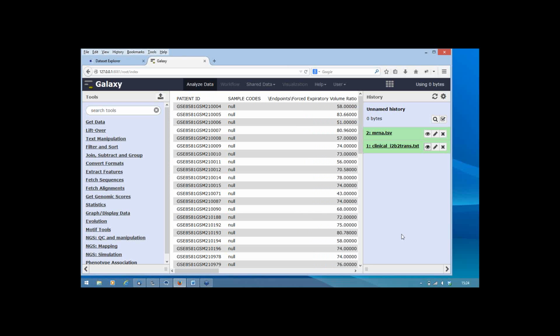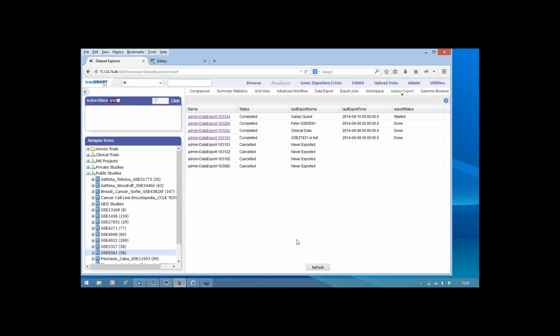Later on today, you'll get a demonstration from Kesa and Bocco of doing things the other way around, running outside tools and connecting those to tranSMART to extract data. So you can take that approach as well. Here we're sending, in that case they're pulling. And these capabilities obviously can be extended after 1.2. I'm sure we can all think of great new ideas of where we'd like to send data or where we'd like to get data from.